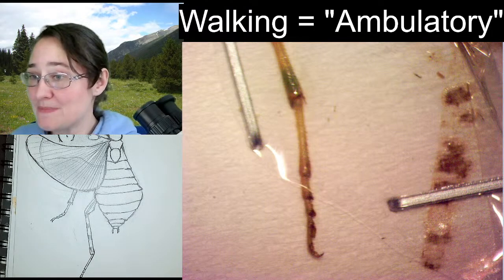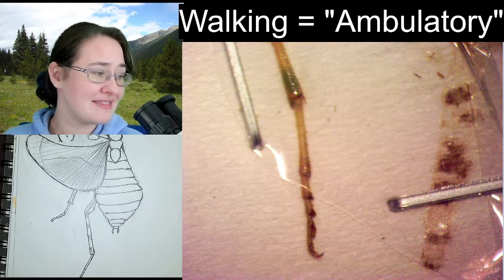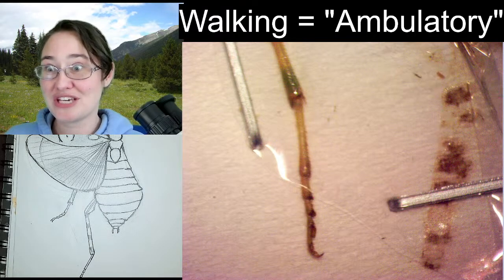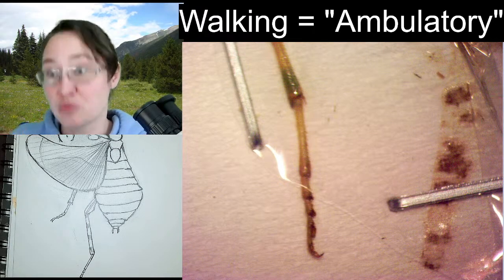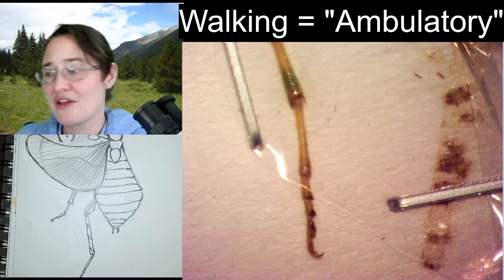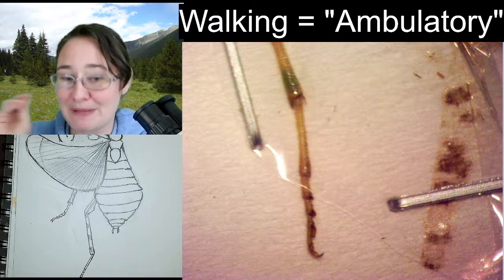They can sometimes be confused with running legs, because running legs and walking legs do look very similar. Seeing them on a dead specimen, they can be trickier to tell apart if you're not sure what the speed is of that insect. But when you see a tiger beetle and you see those really narrow, abnormally long legs, you know those are running legs. Whereas walking legs tend to be kind of average. The average insect is going to have at least one pair of walking legs, even if it's like a mole cricket, where the front legs are digging legs and the hind legs are jumping legs, it still has walking legs in the middle to keep its balance.